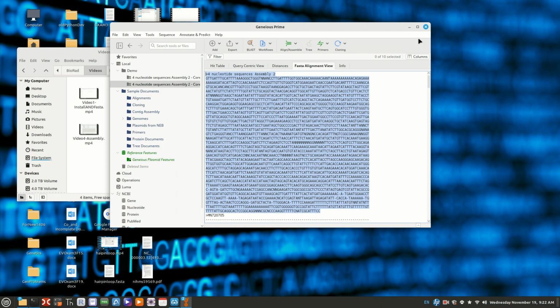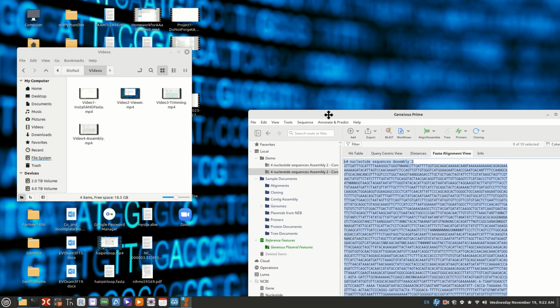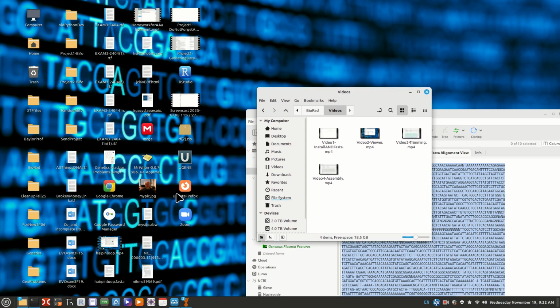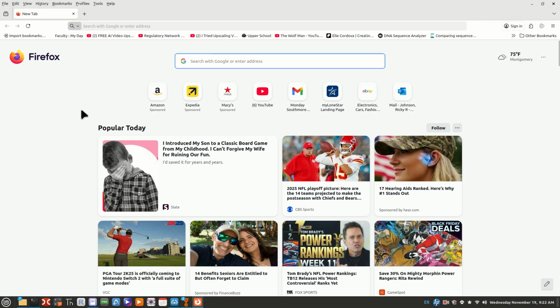I'm going to find a dot plot program. Oop, I didn't want to do that. I want Firefox. Okay, so let's see.